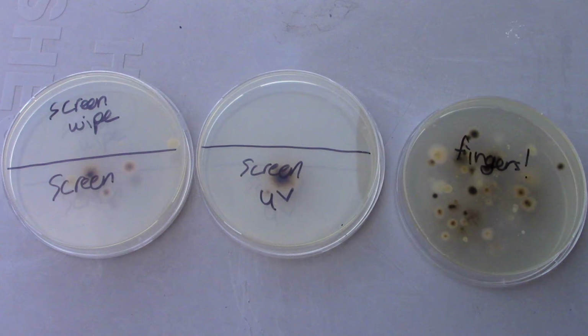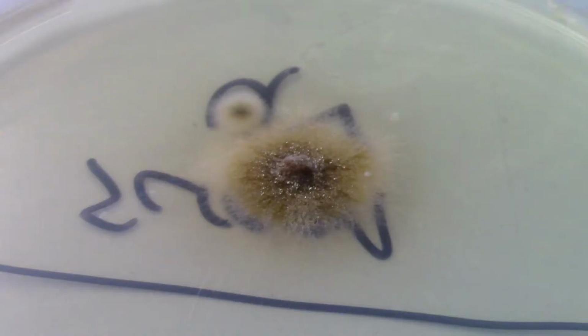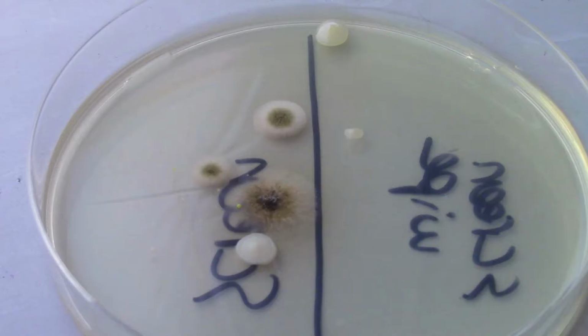Let's take a closer look. So that is on the screen UV, right? Just got a couple of things there, but nice and fuzzy. And there is the screen control on the left before we did any cleaning. And then on the right, we've only got those two little blobs, which I think look like maybe yeast growth or something to me. They're not fuzzy. The tiny little one connects to one of the sun rays, as we called it, right?